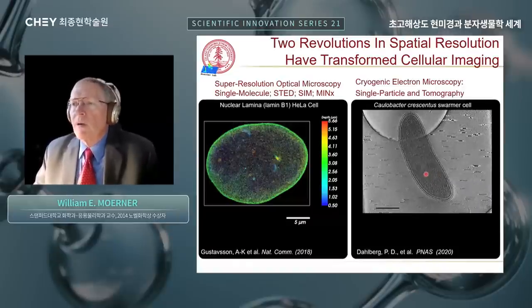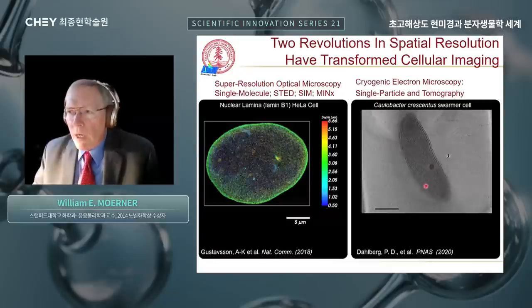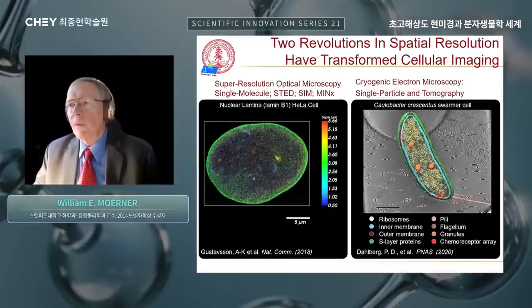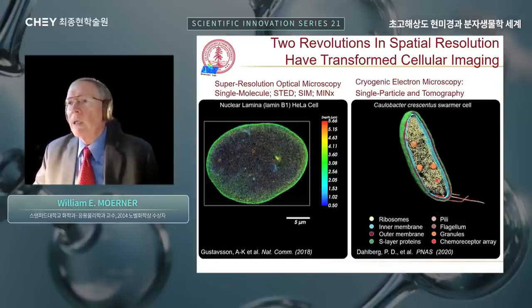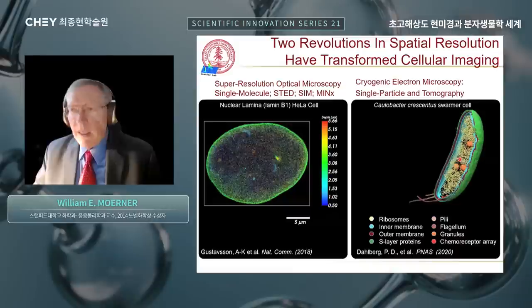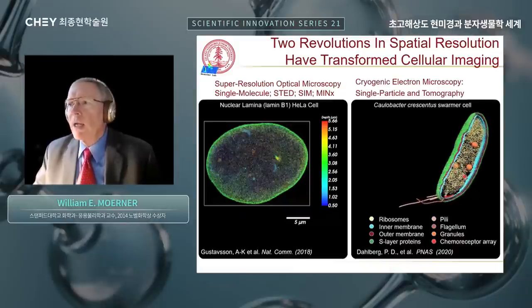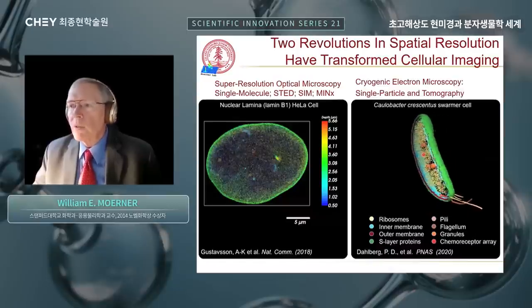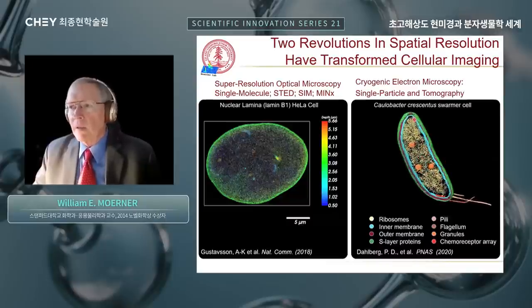Using a series of tilts in the electron microscope with a cryo-EM capability, you can produce those slices that correspond to a 3D image of this object. And you can see it seems to have very high resolution. And then you see that people can annotate that image, pointing out different inclusion bodies or granules, and these little dots that are yellow, we'll talk about in a second. But you can also see the cell walls and pili and so on.